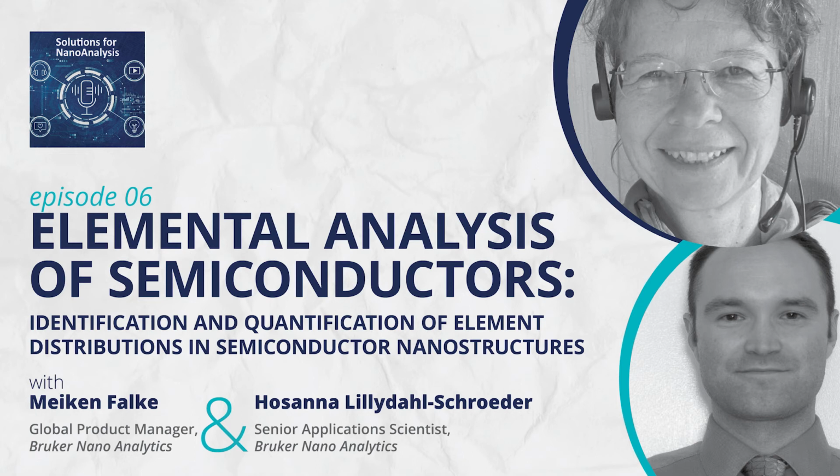In that work, one single EDS detector with a light element window was compared to 4 windowless detectors arranged in an annular geometry around the pole piece of a very similar microscope, and they were compared concerning their performance in dopant analysis. I think we need to discuss this high collection angle annular geometry later on during our little podcast.